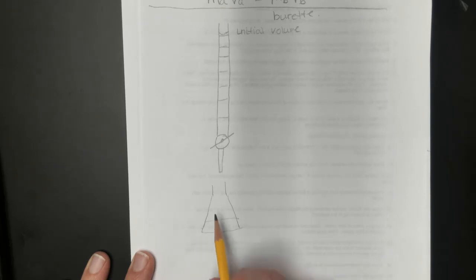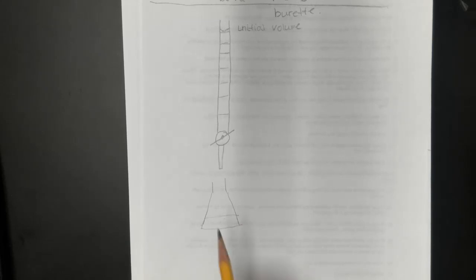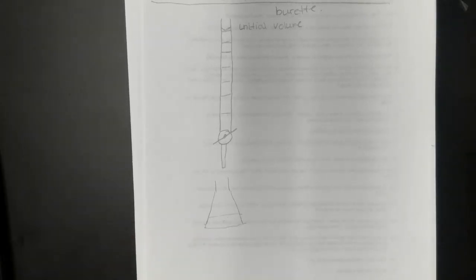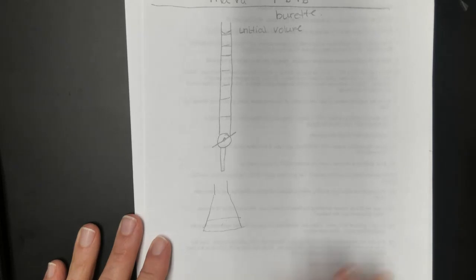Now remember, at the end point, the color change tells you where the end point is. So ideally, you want a very light pink color down here. The lighter, the better. When I was doing the acetic acid titration, it looked like I was right on the end point, about as good as you can get it. I wasn't quite sure. I thought I could see some pink, but I'm not sure it would be obvious to you through the camera. So I added one more drop, and then boom, the whole thing turned a really dark pink. That's the problem with these types of titrations. One drop and you can go too far. But the principle would be the same. We add sodium hydroxide through here, and we wait to get to the end point. And then we stop. It tells us when to stop.